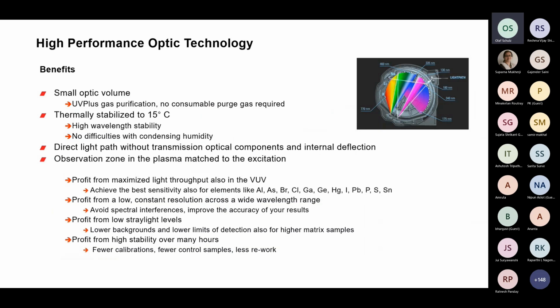The further developed design is called ORCA, and this is used by Spectro. It includes 3 individual polychromators merged into a single optical system. Using 2 entrance slits and a 3rd virtual slit, the light from the plasma illuminates all gratings and thus enables simultaneous detection of all wavelengths between 130 and 460 nanometers, plus the alkali elements up to 770 nanometers.